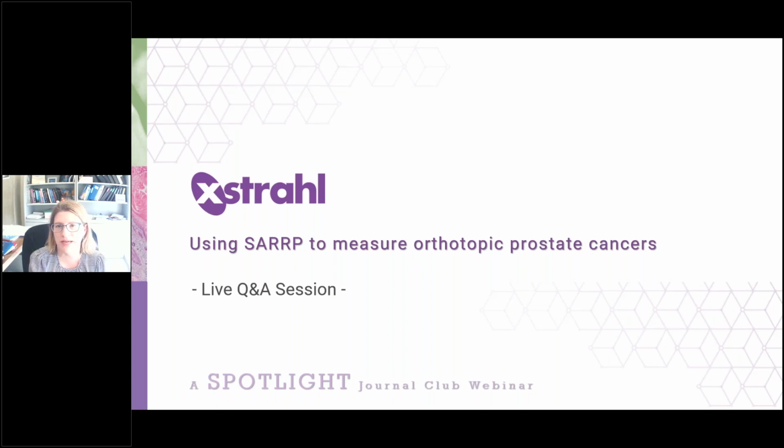Usually, if we have maybe 20 animals, we can get that done in an hour for imaging using the CT imager. Compared to the IVIS machine, you can do 5 animals at a time, but you also have to wait 15 minutes after you inject. So really, it takes about an hour to measure about 20 animals using the IVIS imager as well. So there really isn't that much more time. It may be a little more time intensive to do the CT analysis, but it's not that much more.